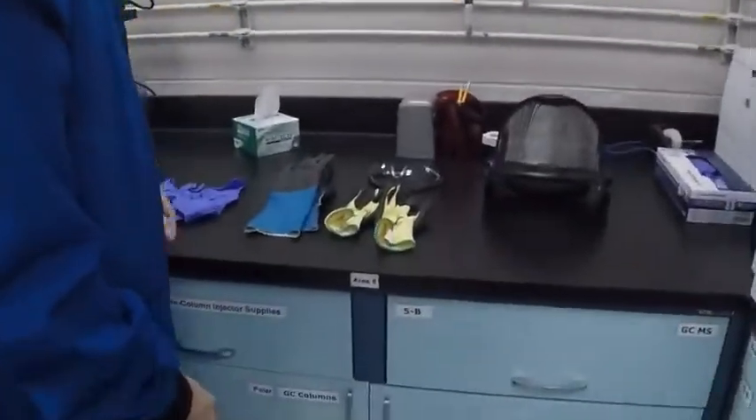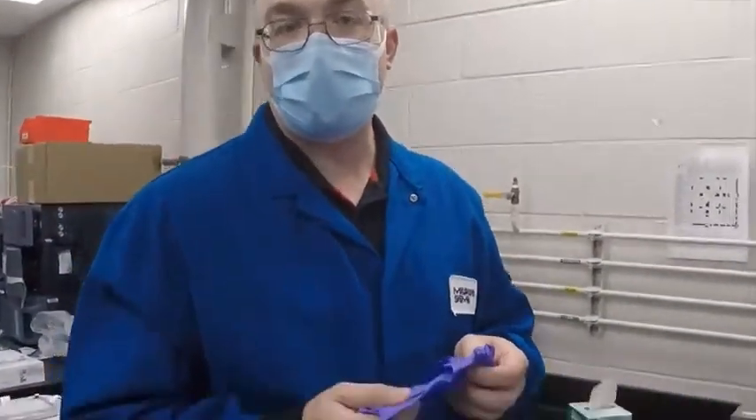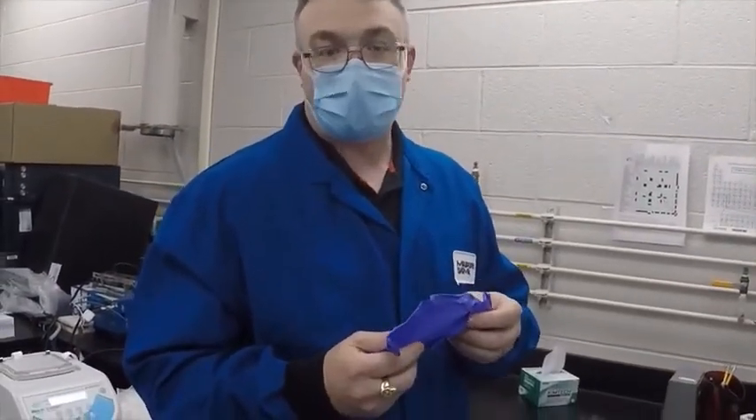First, we want to talk about safety gloves. There are several different types of safety gloves you'll find in your lab. The most common gloves are your nitrile gloves. These are your general chemical resistant gloves, and they are good for general purpose use with various types of chemicals.